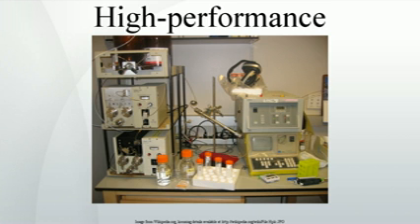Larger particles are used in preparative HPLC, column diameters 5 cm up to greater than 30 cm, and for non-HPLC applications such as solid phase extraction. Pore size. Many stationary phases are porous to provide greater surface area. Small pores provide greater surface area, while larger pore size gives better kinetics, especially for larger analytes. For example, a protein which is only slightly smaller than a pore might enter the pore but does not easily leave once inside.